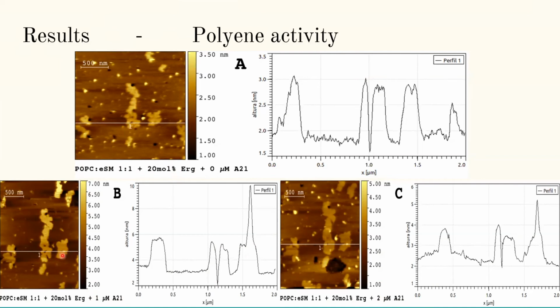Okay, so I wanted to see if this swelling effect carried on with more concentration of A21. So I did another concentration, and you can see that there's a slight difference in the swelling effect of the gel phase. But also at this concentration, there's really big damage done on the POPC liquid phase. So this suggests that A21 also has a detergent-like effect on the POPC phase, which is liquid.